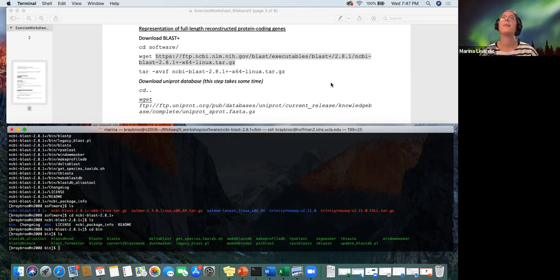Okay, so the newest version is fine. You can download it here just for practice, but the cluster has some issues running it. That's why I'm downloading the older one. But yeah, of course, you should always use the latest if possible because it's going to be more up to date. Okay, so we have all of our executables right here. The one that is important to create the local BLAST database is this makeblastdb.